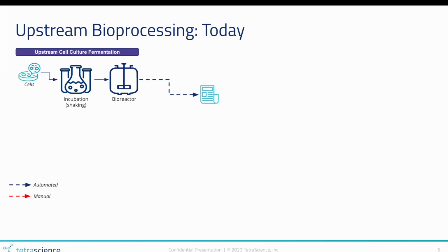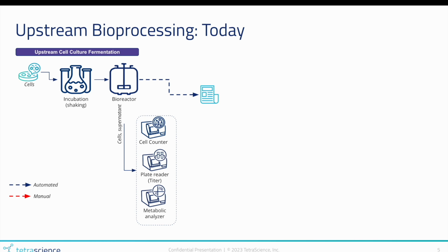There are many inline measurements made throughout this process in the bioreactor, such as temperature, pH, redox potential. And in addition to that, aliquots are taken from different vessels at different time points and measured using things like a cell counter, plate reader for protein titer, or metabolic analyzer.